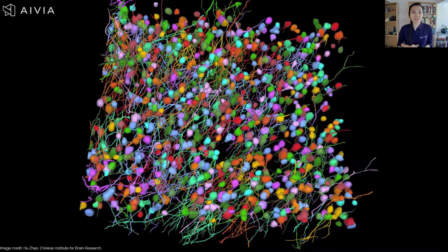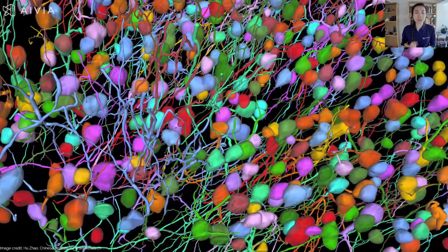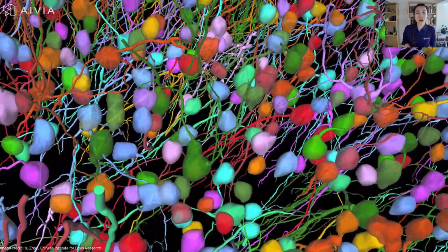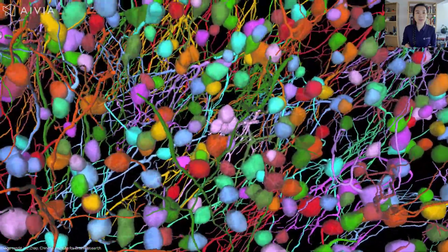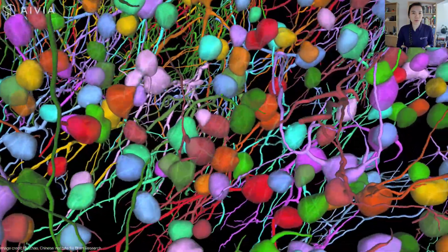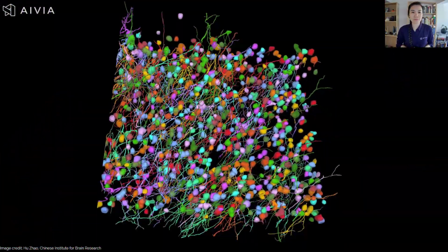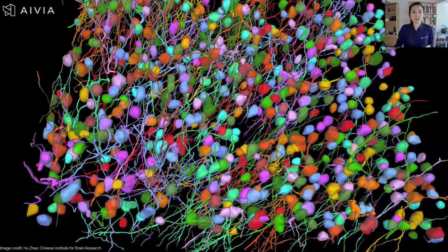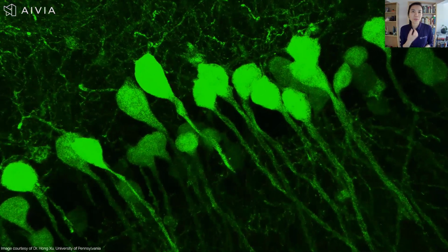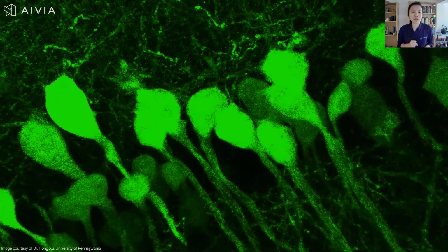Now let's bring all of this together with 2 example videos. The first is utilizing this new option of soma detection by Cellpose to detect neurons in a dense neuronal network. The second video here is a closer look at that partitioning capability that I mentioned earlier.